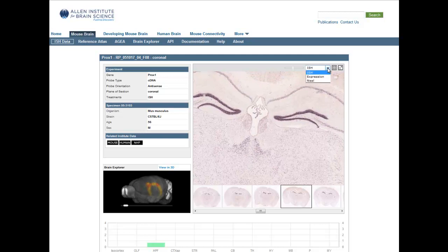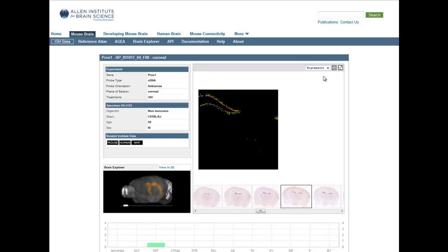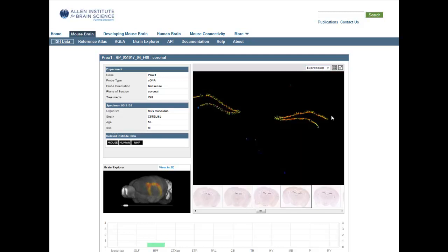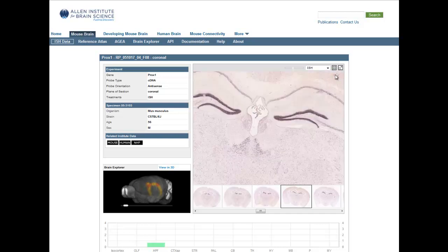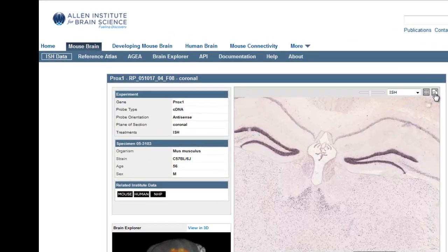To allow you to interpret the data, you can view an expression mask which subtracts out the background signal and represents expression in cool or low expressing colors to hot or high expressing colors. You can also open up your current image in a high resolution image viewer in another window by clicking this icon.